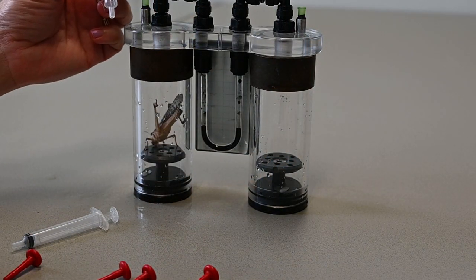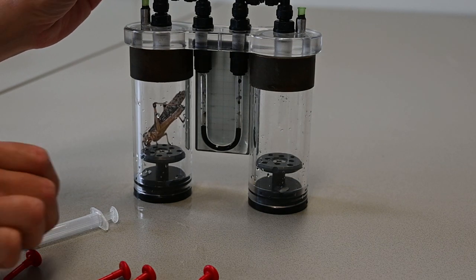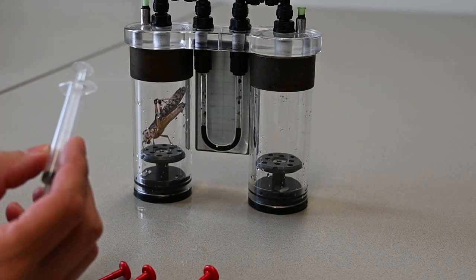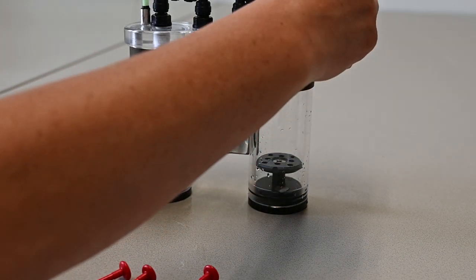One syringe is filled with 2 ml of air and attached to the system. The other one on the right side is filled with 0 ml of air.